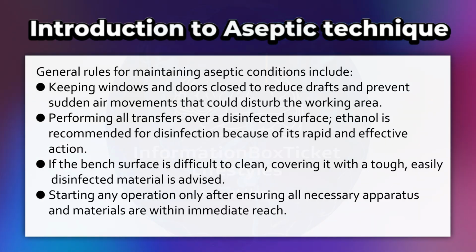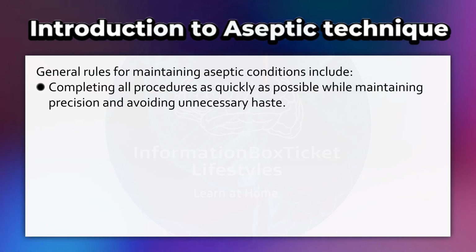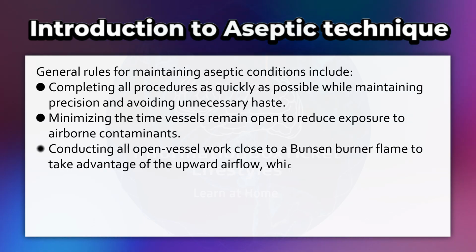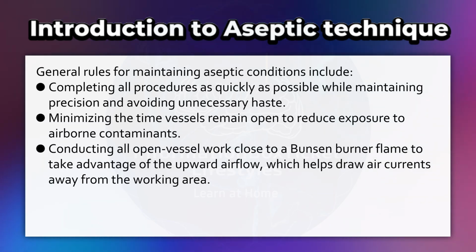Starting any operation only after ensuring all necessary apparatus and materials are within immediate reach. Completing all procedures as quickly as possible while maintaining precision and avoiding unnecessary haste. Minimizing the time vessels remain open to reduce exposure to airborne contaminants. Conducting all open vessel work close to a Bunsen burner flame to take advantage of the upward airflow, which helps draw air currents away from the working area.